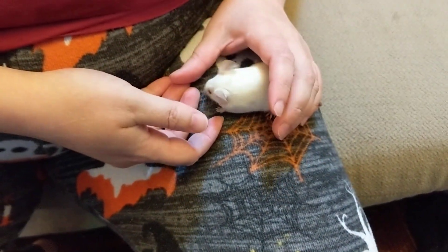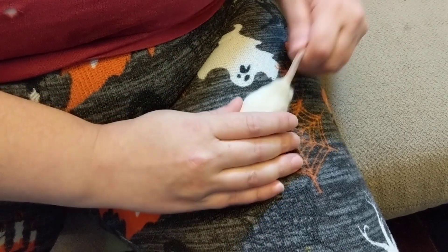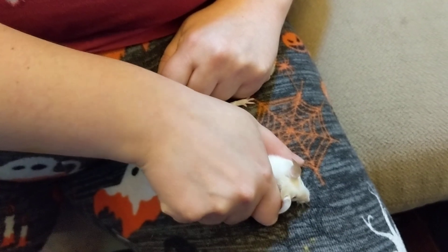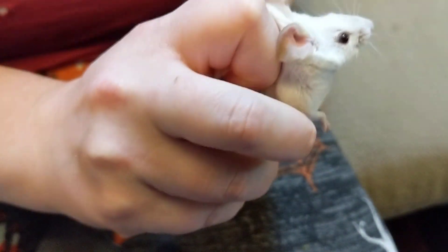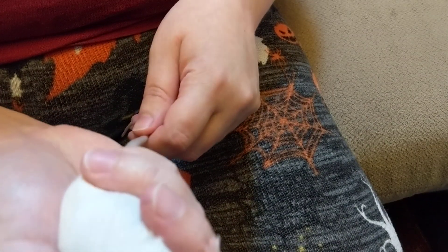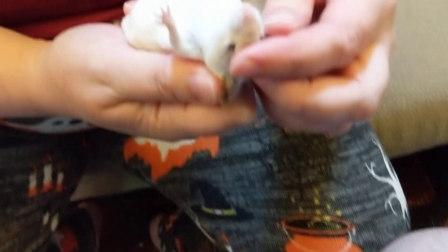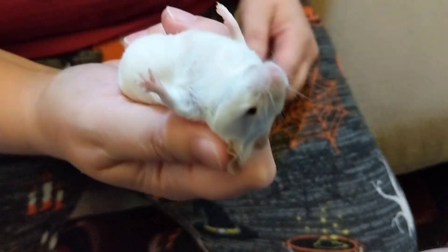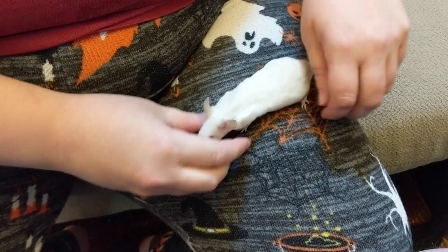All right, we're going to show you how to scruff a mouse and give an oral medication. Normally when we scruff them, you would put your fingers here and follow up, and that allows you to grab the scruff behind their head. If you're restraining them — your mice are probably a little smaller than mine — you would want to hold the tail under your fingers here. Mine are really nice, so they're not really interested in biting the heck out of me, but yours might be. So just be really careful with that.